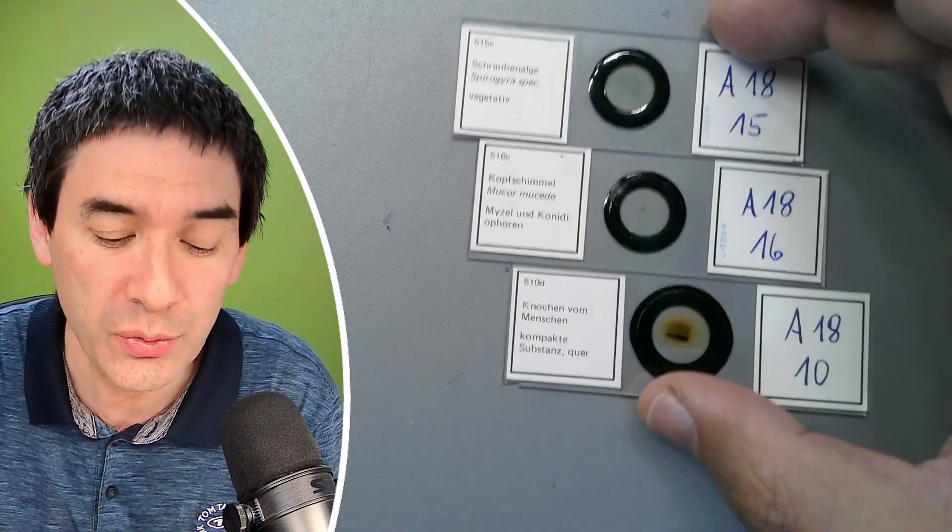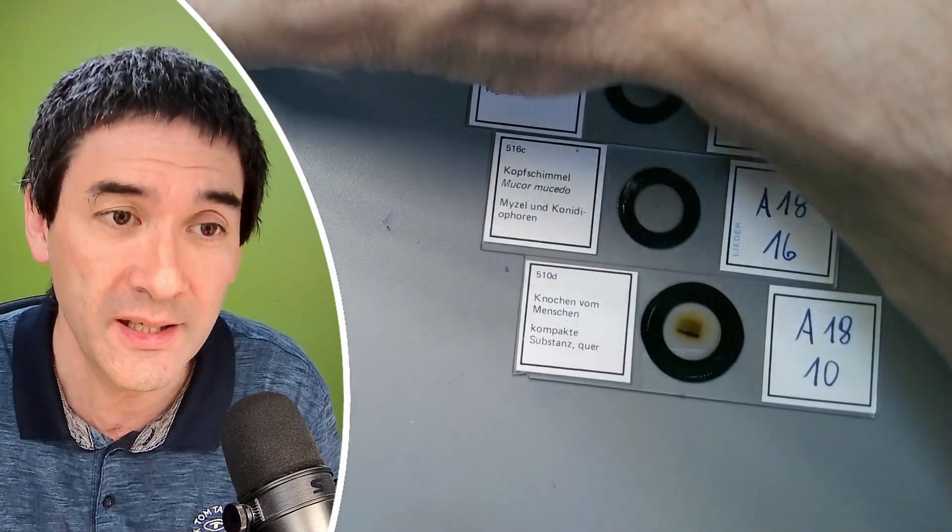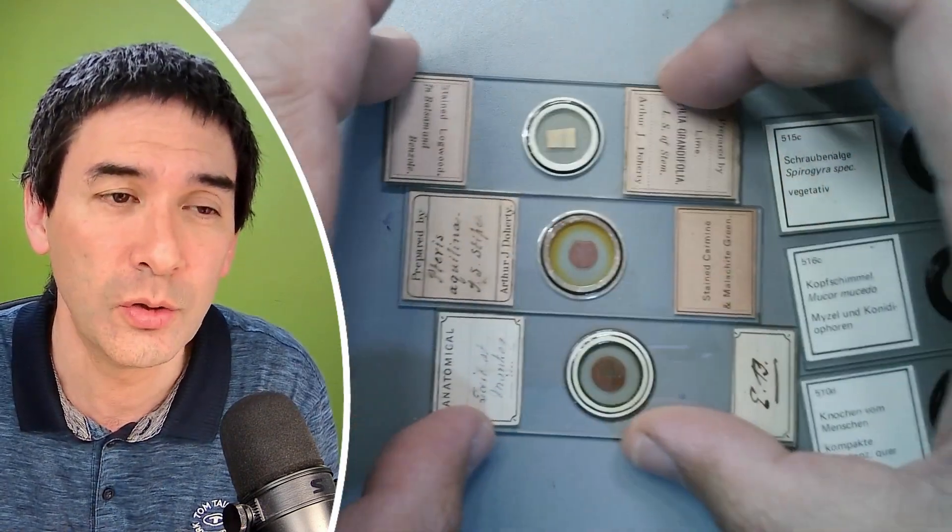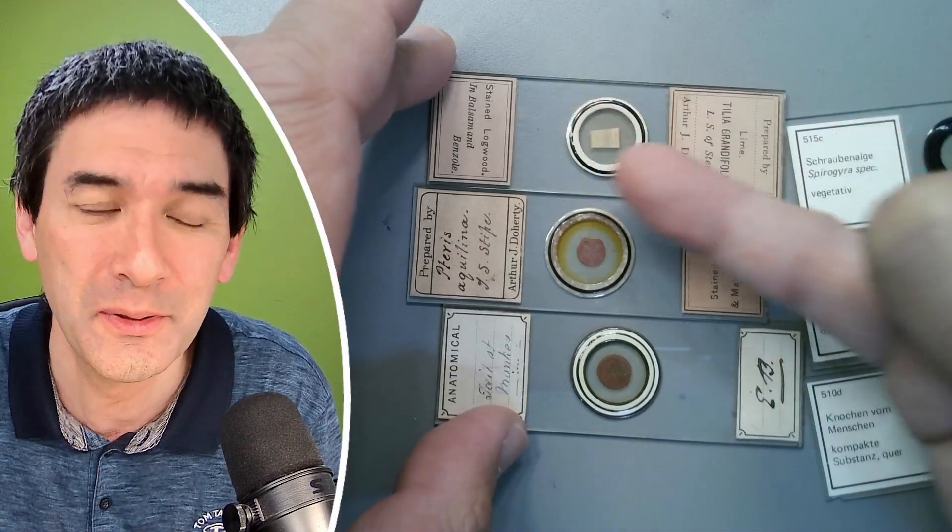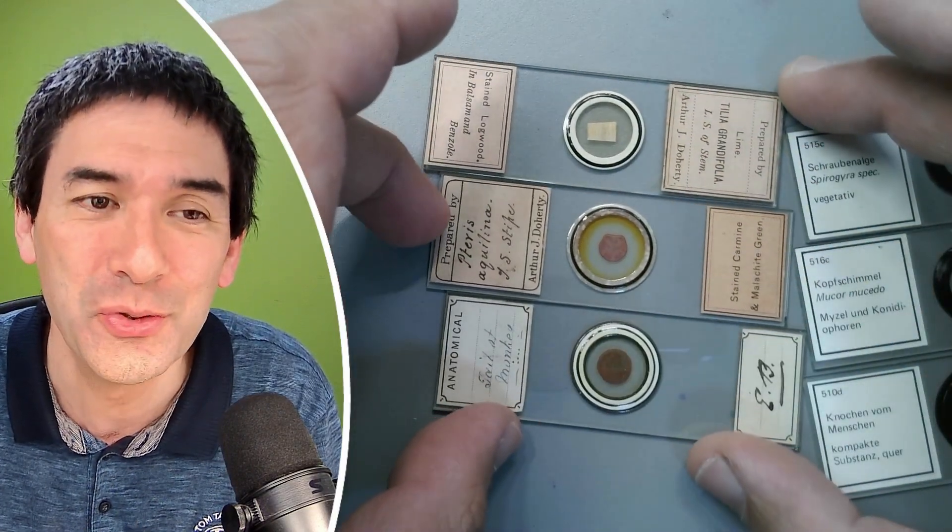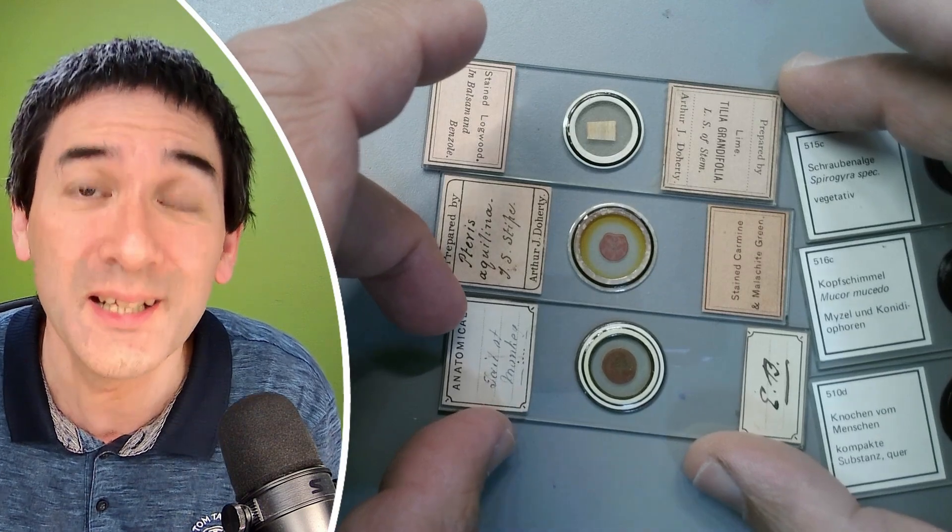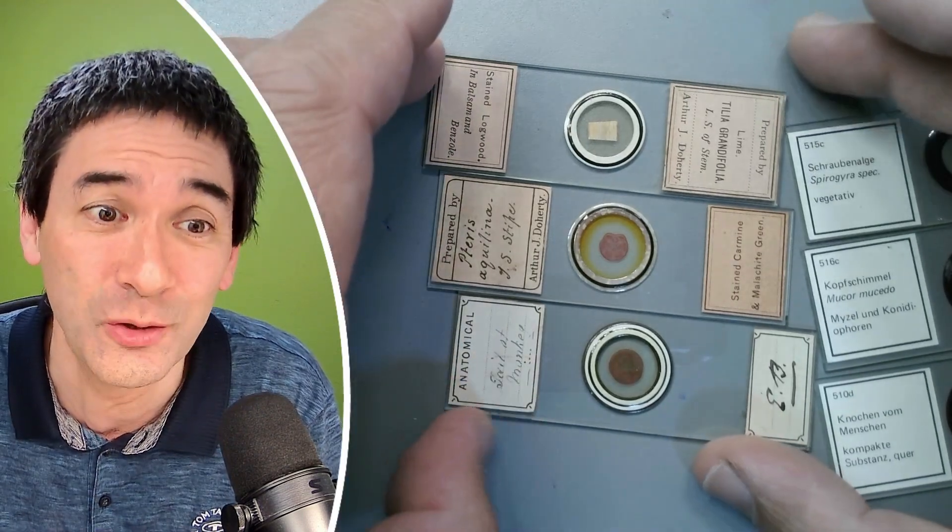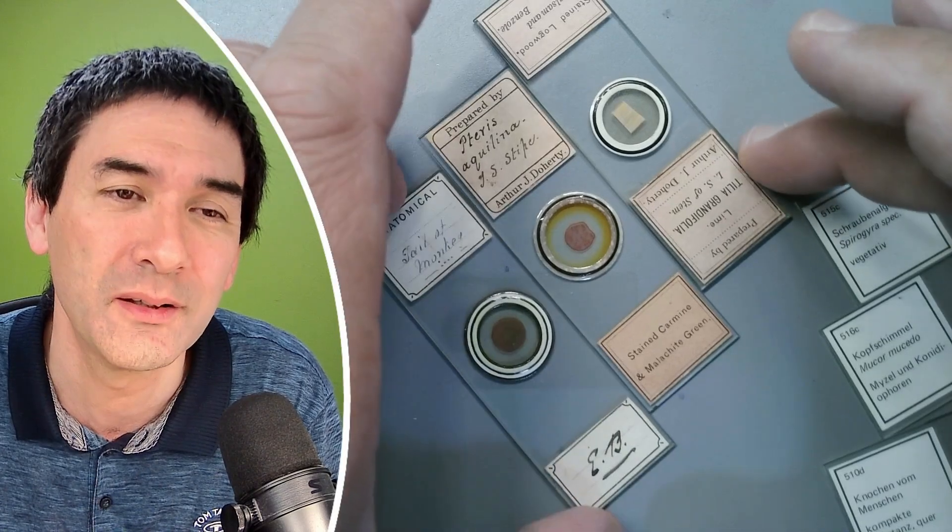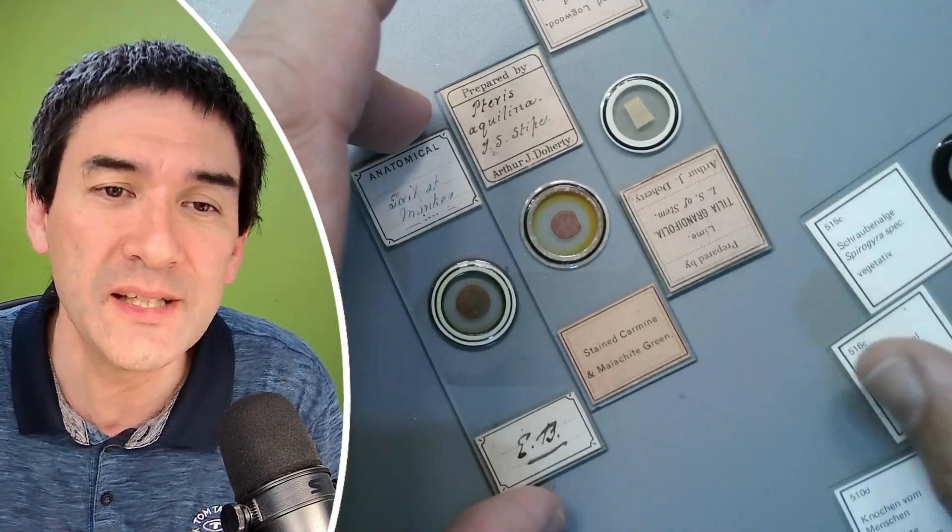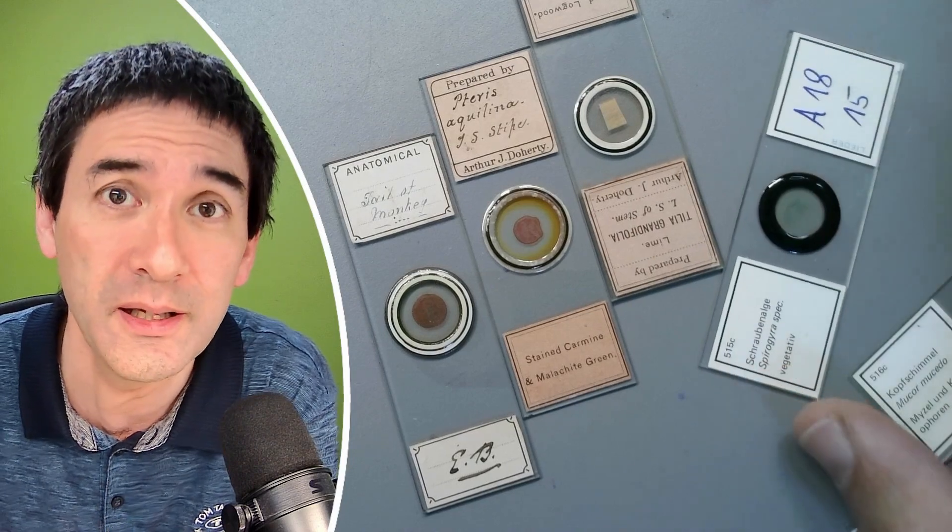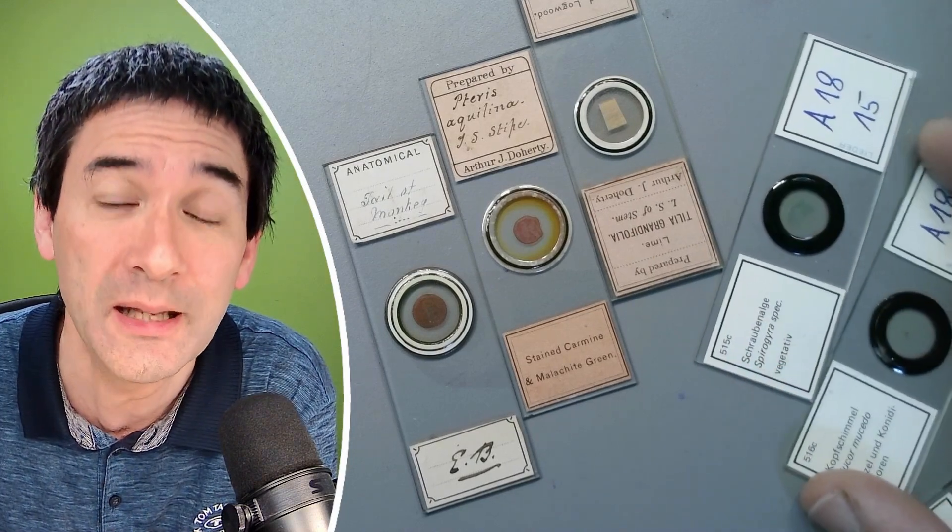I also want to show you some antique microscope slides. This is actually quite really nice. Look at those here. Here they are also ringed and not only that but actually have a color pattern here. So the ring is also used for aesthetic reasons. It looks nice and also for branding purposes. However, those rings actually do also have an important functional role. They play an important role also in stabilizing the specimen.